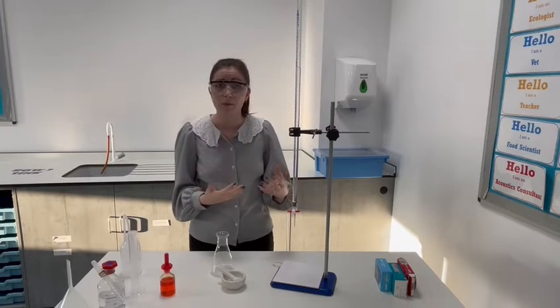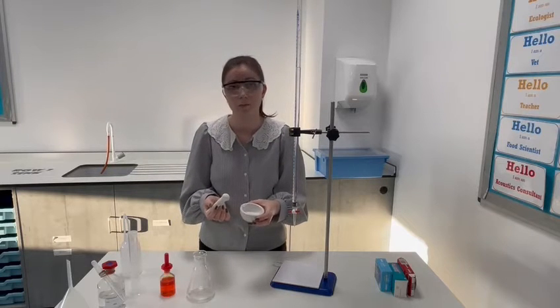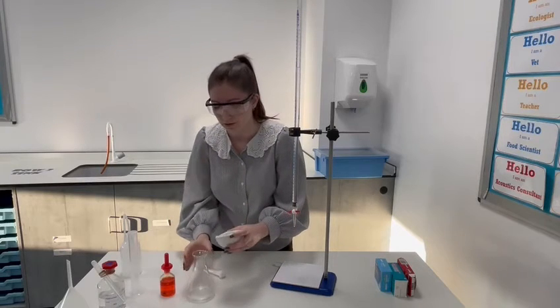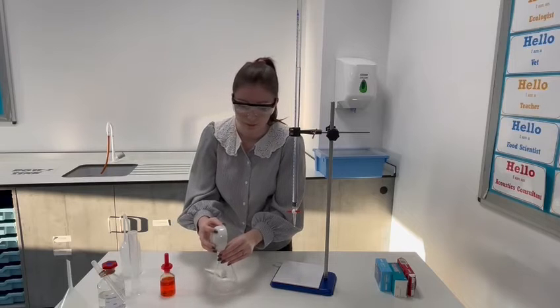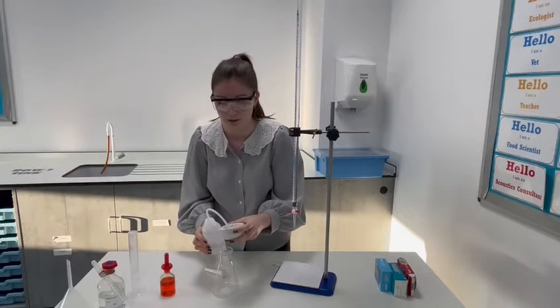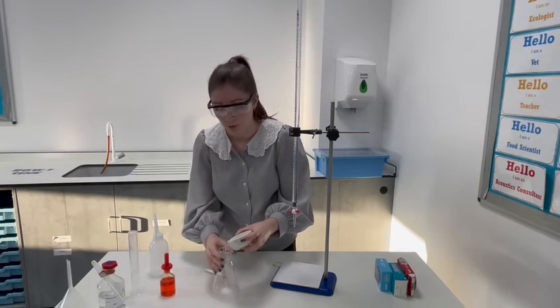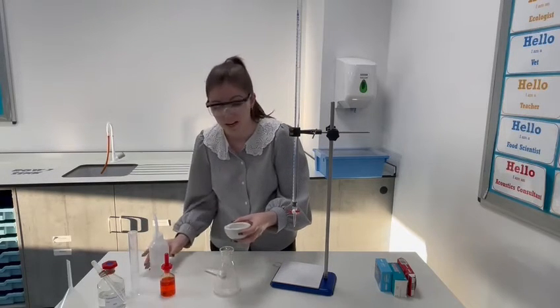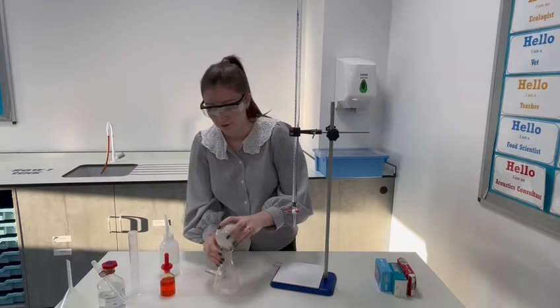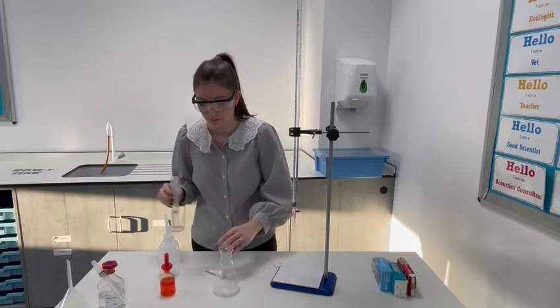So in terms of carrying out the practical, the first step that students would need to do is to grind the indigestion tablet in a pestle and mortar, which I've pre-done here. So I'm going to just put that into a conical flask. And it's important that we get all of that tablet in there. So after I have poured that in, I'm going to rinse that with distilled water. And again, these are practical skills that students will use again and again, so it's valuable practice. And you can discuss why it's important that all that tablet goes into the conical flask in terms of accuracy, and also the fact that we're comparing, so we need to make sure the full tablet's in there.